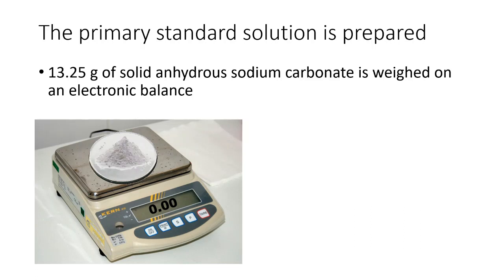And then I put the powder on the dish until it has a mass of 13.25 grams. That's solid anhydrous sodium carbonate powder. Anhydrous means, of course, there is no moisture, there is no H2O in that powder, hopefully.